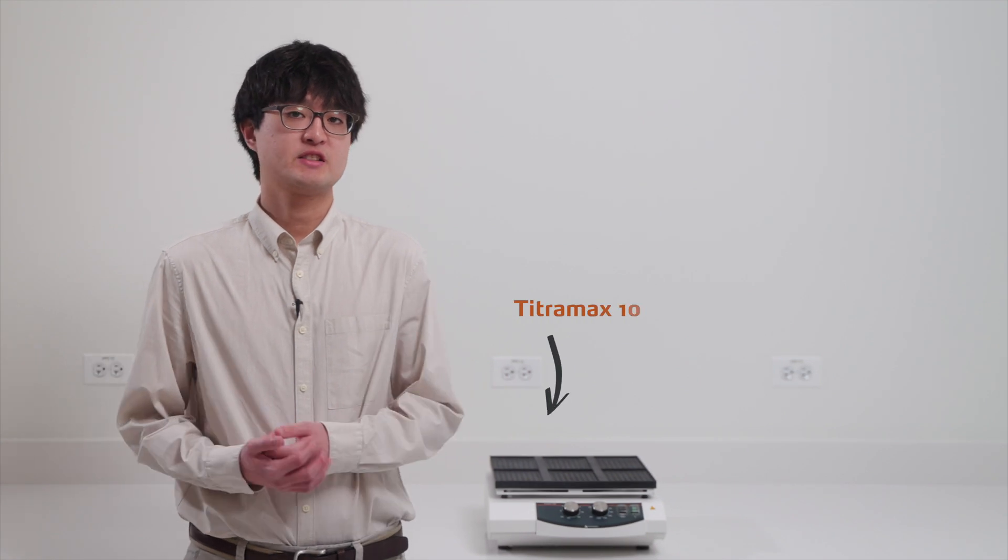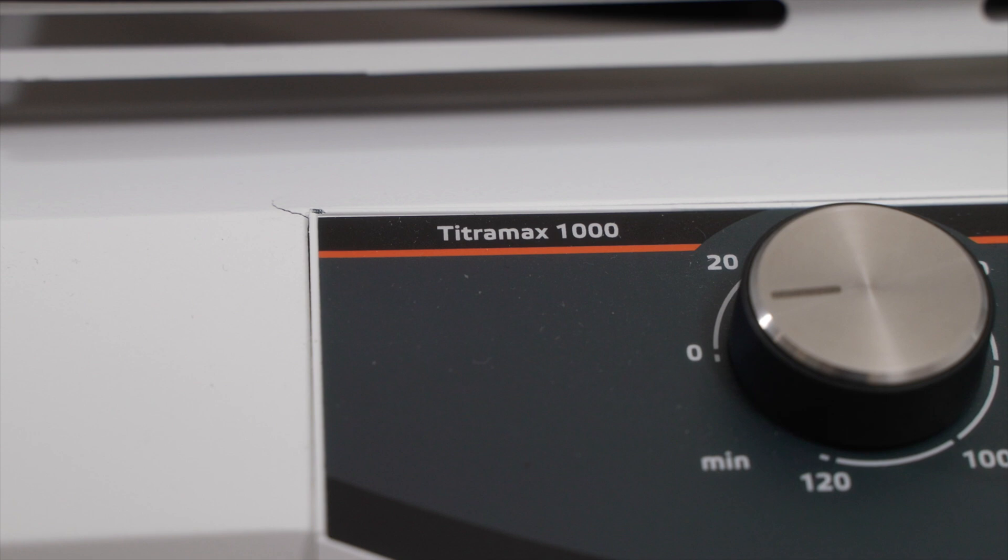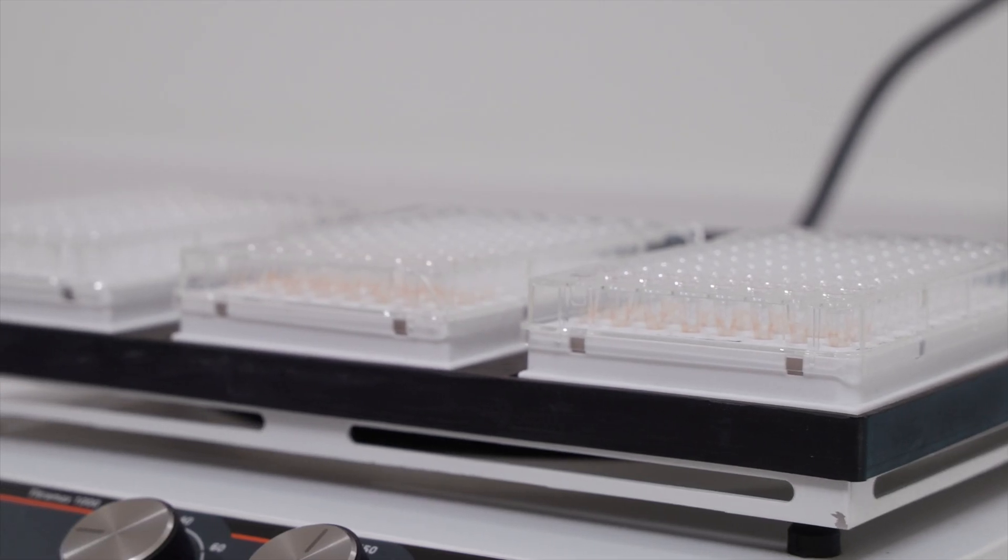The final model in the Titramax series is the Titramax 1000. The Titramax 1000 is our largest model as it can hold up to six micro-titer plates. It has a vibration orbit of 1.5mm and shakes at speeds up to 1350rpm.